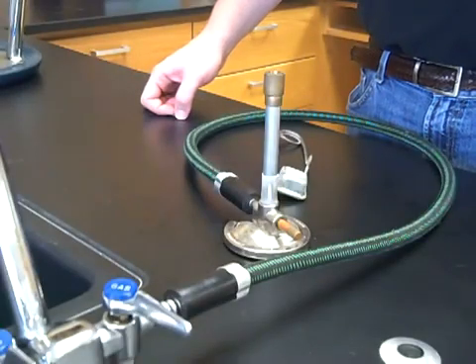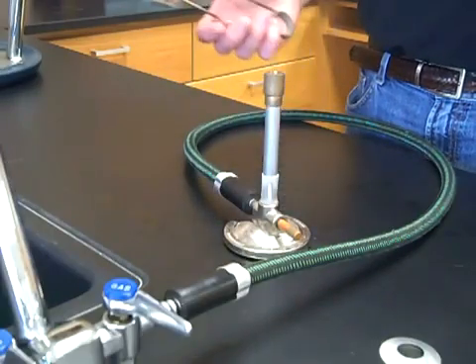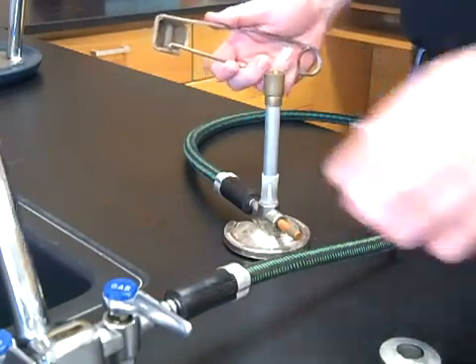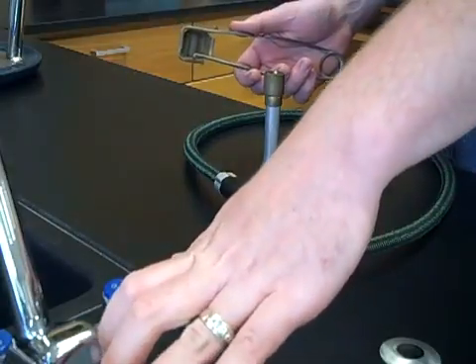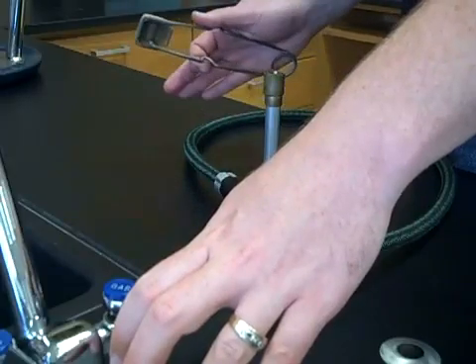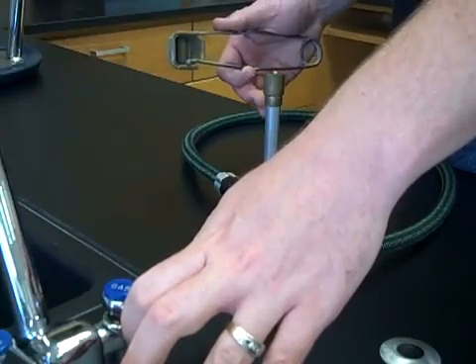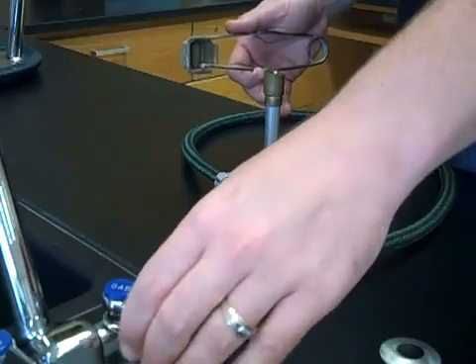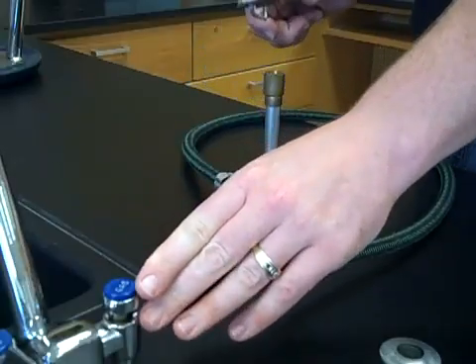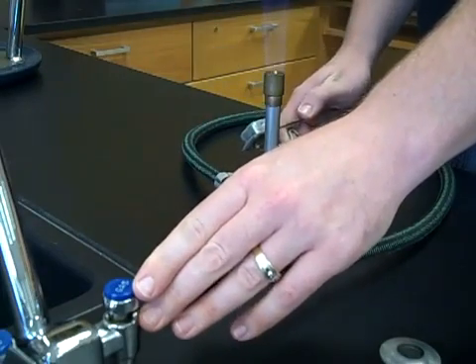When you're ready to ignite the Bunsen burner, it's a two-handed operation — only one person should be operating it at a time. In one hand, hold the striker, which is a simple flint and steel device; squeeze it and a spark is produced. Your other hand goes on the gas jet supply handle. Make sure everything flammable is out of the vicinity, and that hair and clothing are tied back or rolled up. Turn on the main gas so the handle is parallel to the gas jet, listen for gas flow, hold the striker above the barrel, and squeeze until the flame ignites.